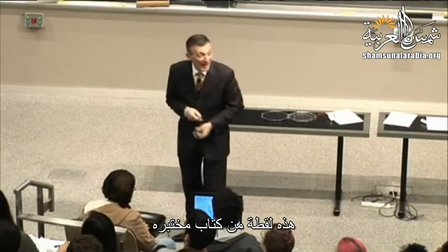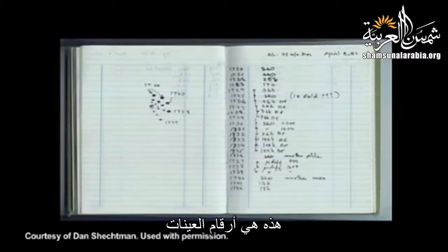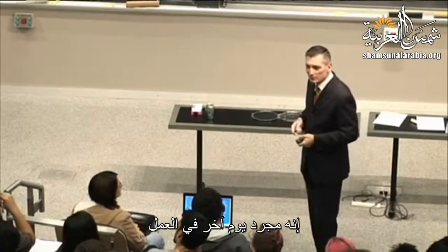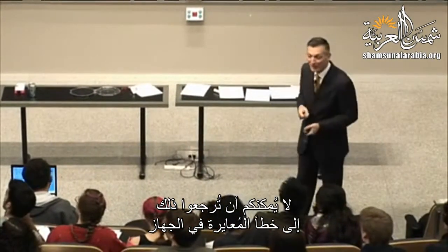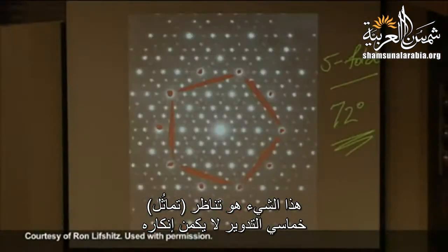Now, this is really, really exciting. This is a shot of his lab book. You're looking over his shoulder. These are the specimen numbers. And this is aluminum 25% manganese, April 8th, 1982. So he's just, another day at work. You could be doing this. And he can't believe what he's getting. He's going, what's going on? I mean, you can't attribute this to a calibration error on the instrument. I mean, this thing is unassailably 5-fold symmetry.